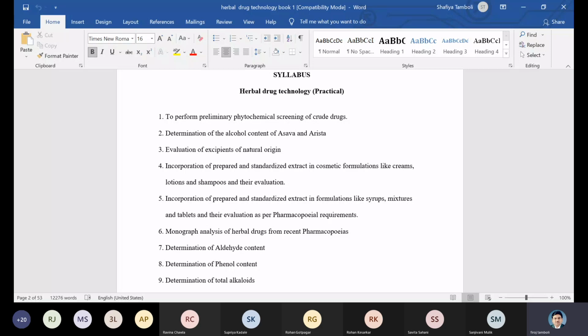After the first cycle, suppose you take chloroform, then whatever residue or extract comes in the round bottom flask, you stop your process. How can you indicate that your process is stopped? When your solvent becomes colorless. That indicates that whatever was present in your plant material is now in your solvent. Then you stop the process, remove that plant material and dry it for 24 hours.